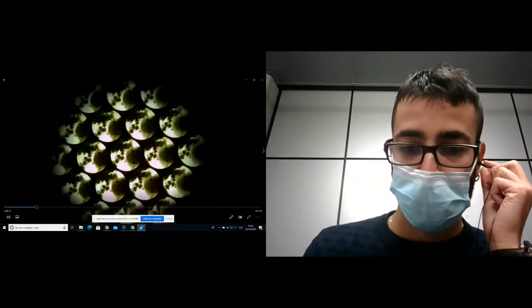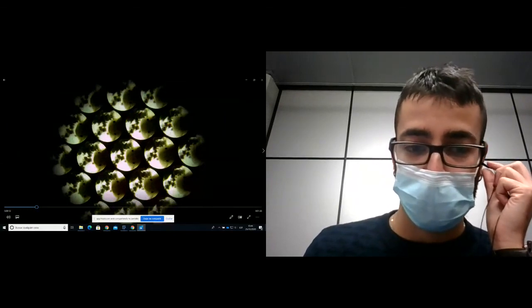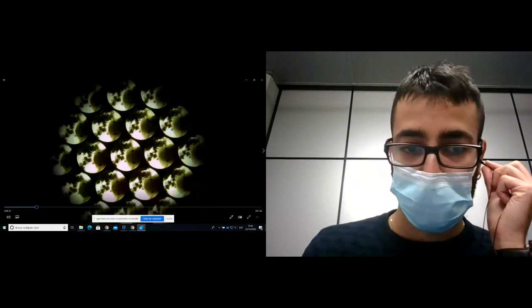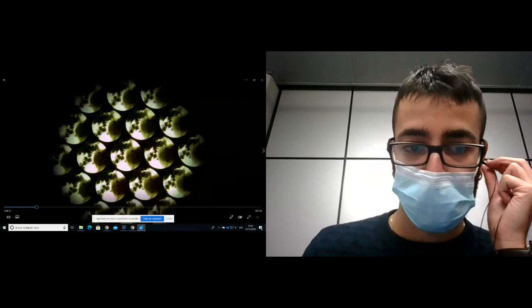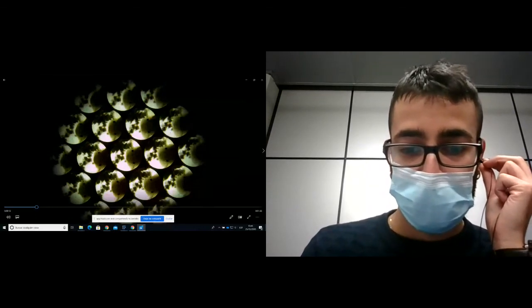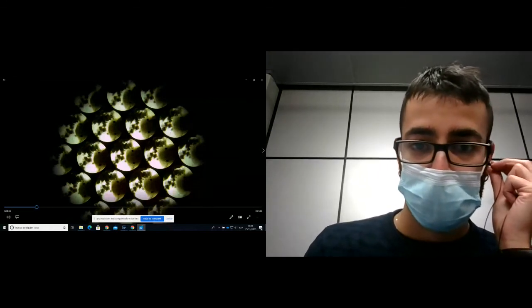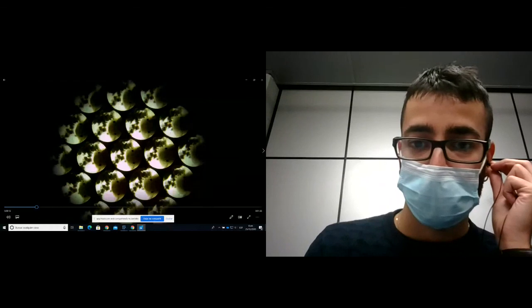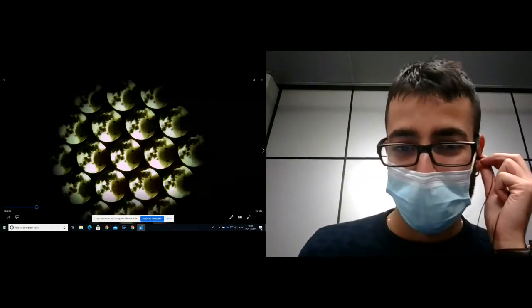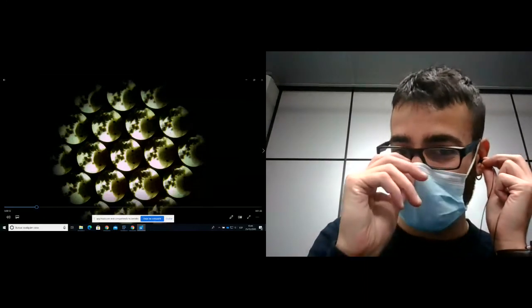From this video, we just did a really simple reconstruction, focusing at one plane and then refocusing at different planes of the sample. It's a really simple reconstruction, just to demonstrate.